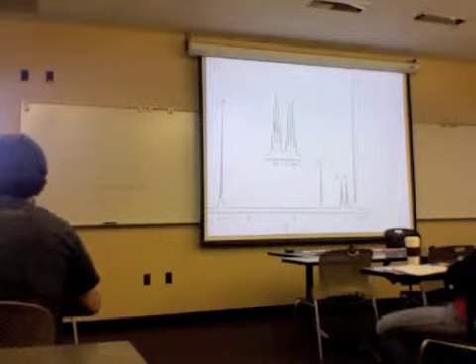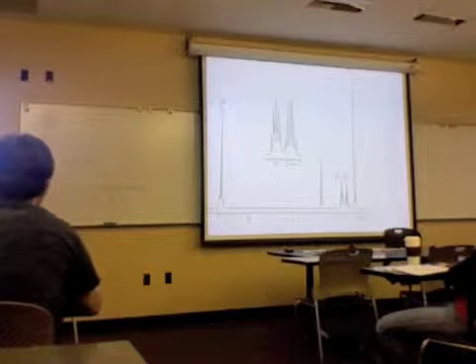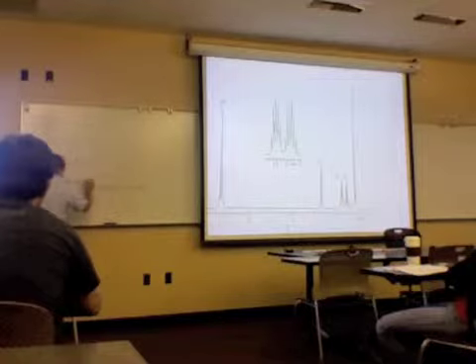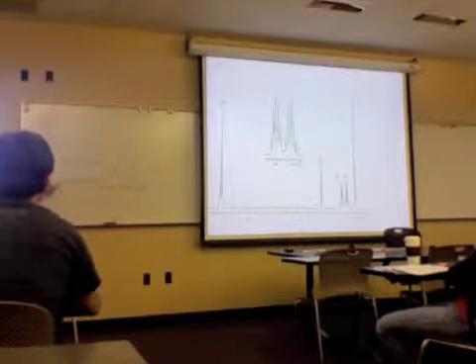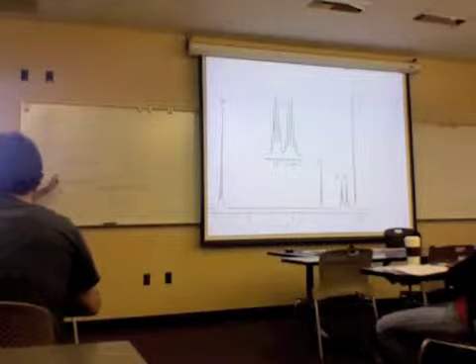It looks to me like we've got our compound. You may not think that we've got our compound. But if I take that and attach it to a benzene ring, we're there, like this. This will only have 2 hydrogen neighbors because there's no hydrogen here. So it'll be split into a triplet, and it'll be further downfield because of the influence of the ring.